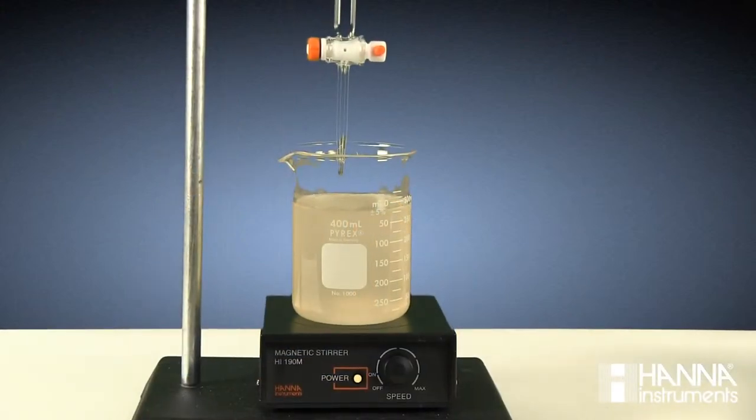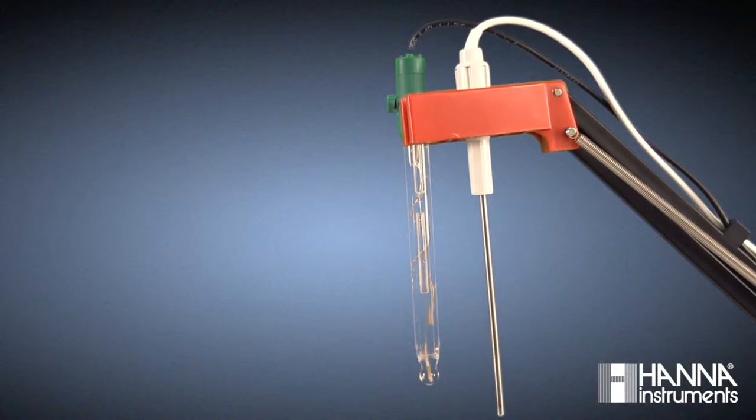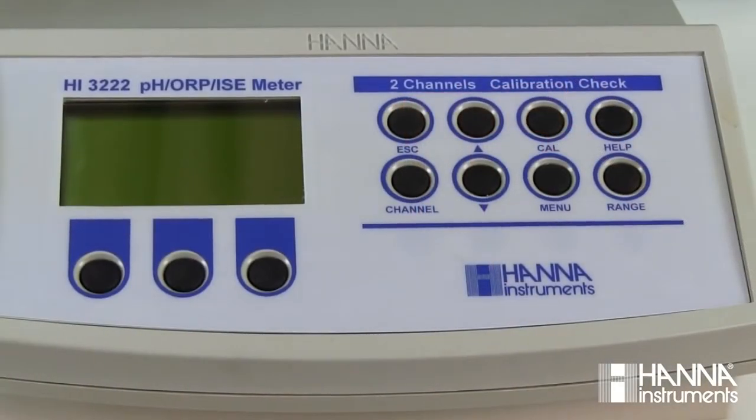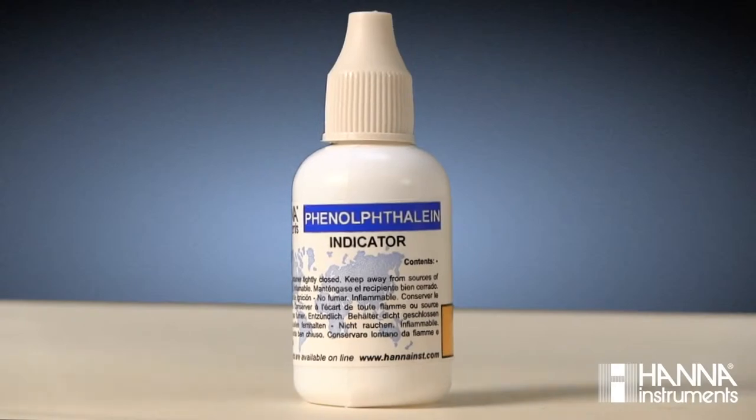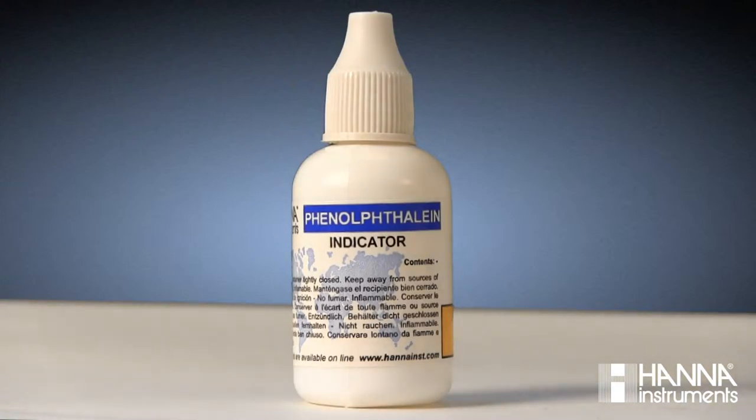For the determination of percent citric acid in orange juice today, we'll be using a 10 milliliter sample, which we obtained volumetrically and diluted with distilled water. We're going to examine the two most commonly used methods for endpoint determination in a manual titration: potentiometrically with a pH electrode and pH meter, and using a color indicator, which today is phenolphthalein. This method has an endpoint of pH 8.2, which coincides with the point that phenolphthalein changes from a colorless liquid to a pale pink.